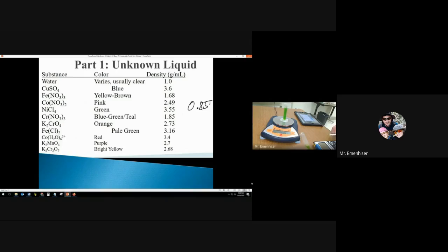Okay, it is a pretty green liquid though. It's not poisonous though, or anything. It's not dangerous. I could probably drink it. It wouldn't matter. I wouldn't though.